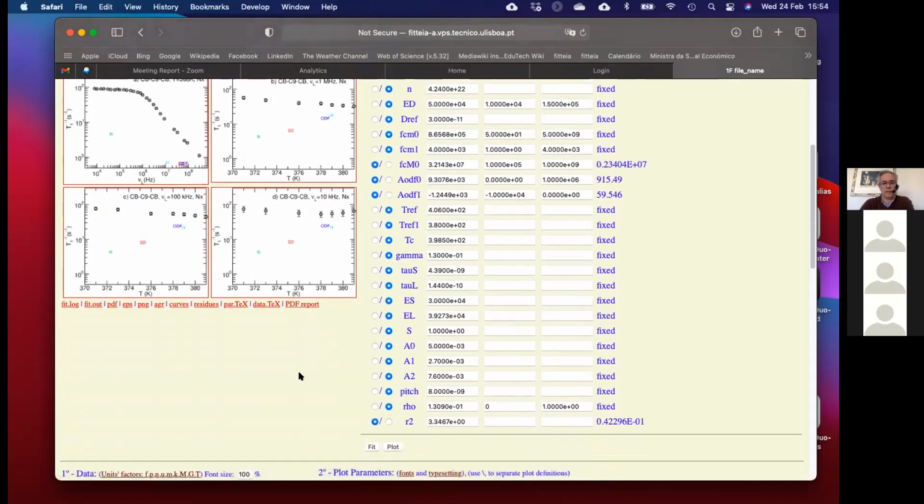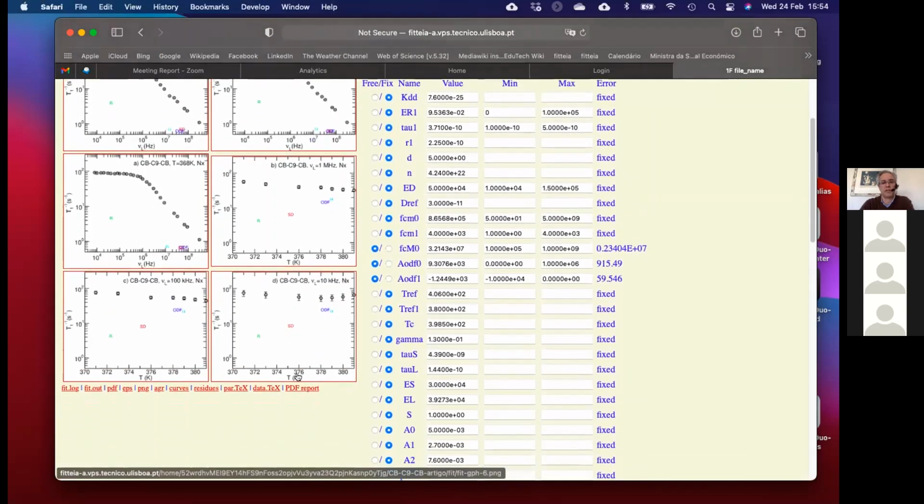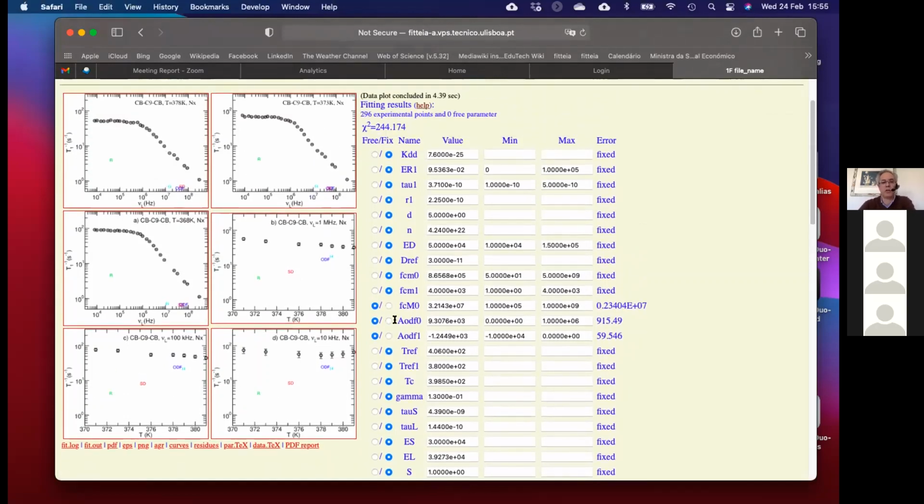So the model for such a system can be described in terms of the structural physical parameters.